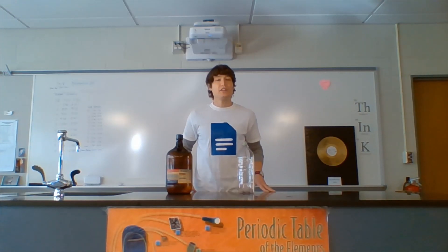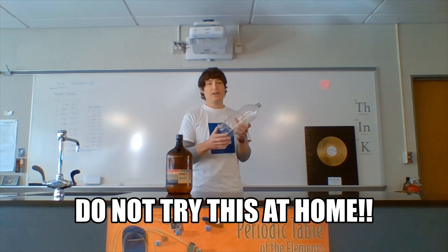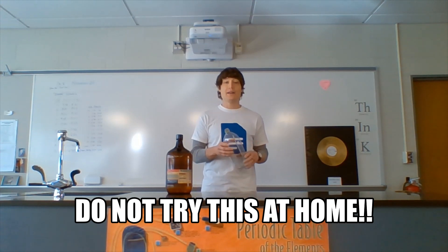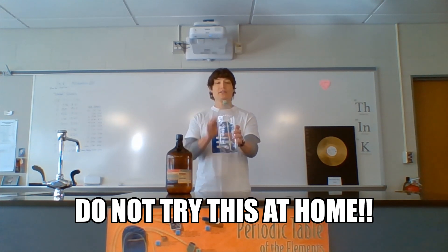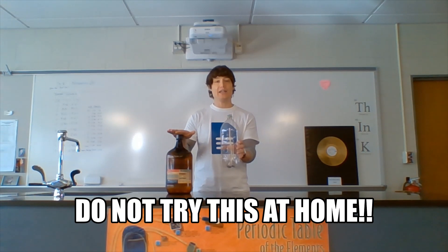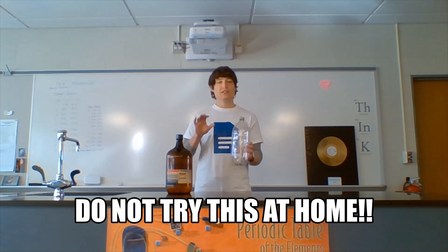First up we have the combustion of ethanol alcohol. I'm going to put about 15 to 20 milliliters of ethanol alcohol into a two-liter bottle, swirl it around a little bit, then dump the rest out. After that, I'm going to ignite near the mouth of the bottle, and the fumes from the ethanol alcohol are going to ignite, showing the chemical reaction between oxygen and alcohol.